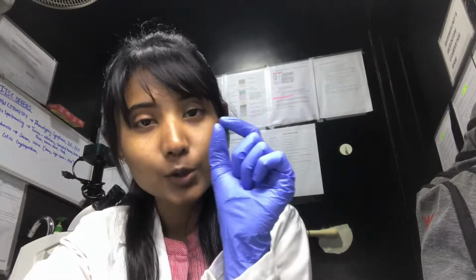But it has its own uses because you can see dermatophyte spores in the shaft of the hair and demodex mites towards the roots. You can also identify color dilution alopecia. In this method, you can only see the external surface of the hair, but if you want to see the internal surface of the hair, then you have to process the hair with 10% potassium hydroxide.